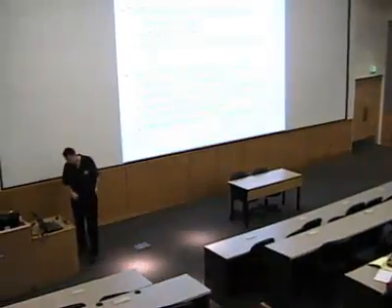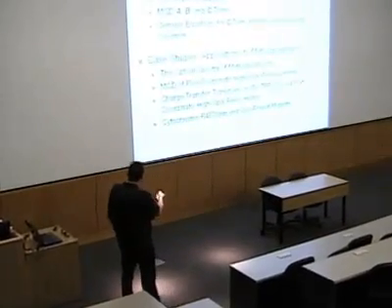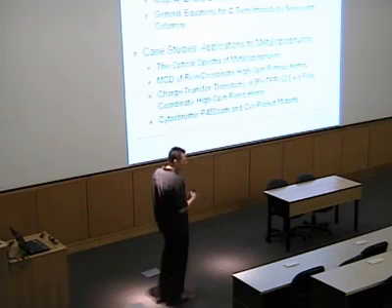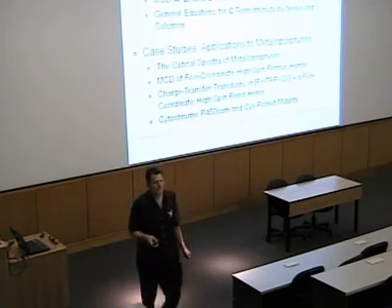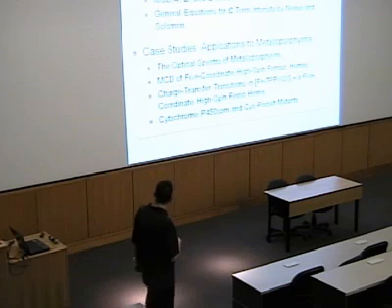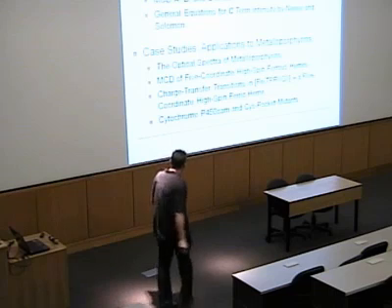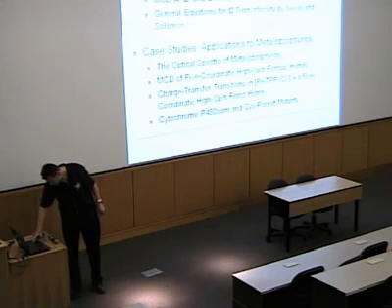So just like you see with the other presentations, the outline here is the same. We start by thinking about the theory of magnetic circular dichroism, understanding what the experiment is and what we are doing, and then from there we'll transition into some examples. In my lab, we do a lot of work on metalloporphyrins, so my examples here are kind of biased in that regard. We're looking a lot at metalloporphyrins and their MCD spectra.